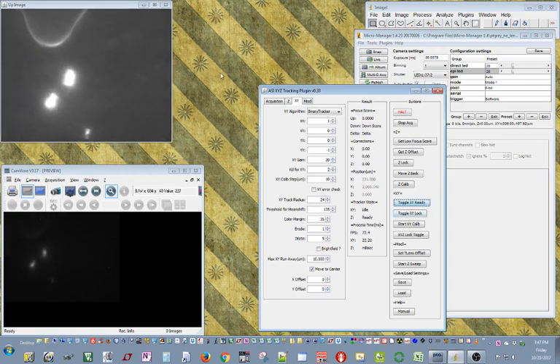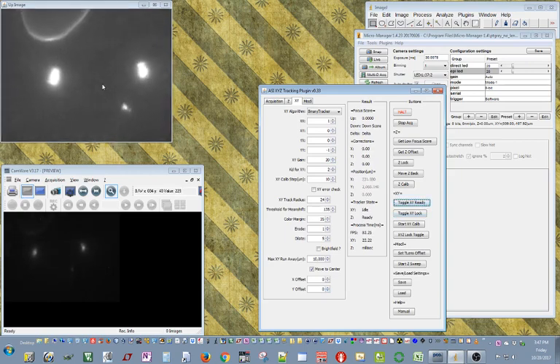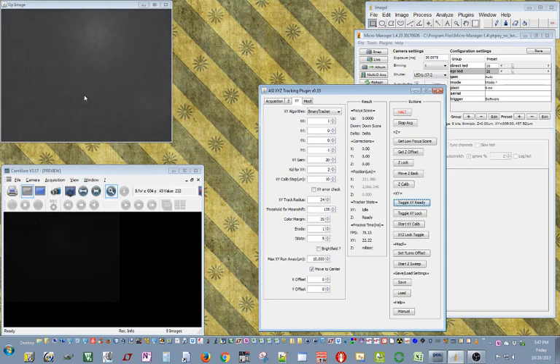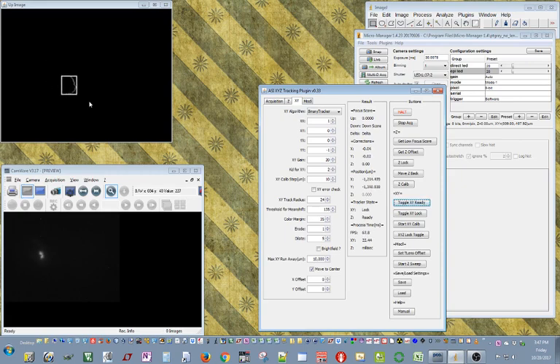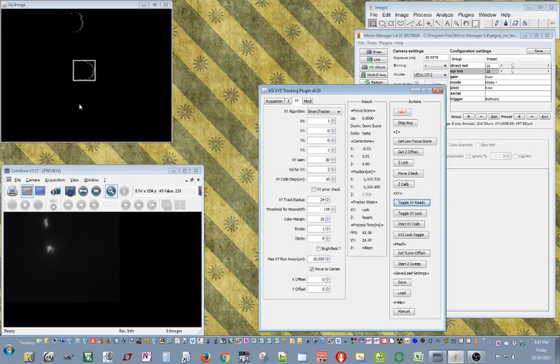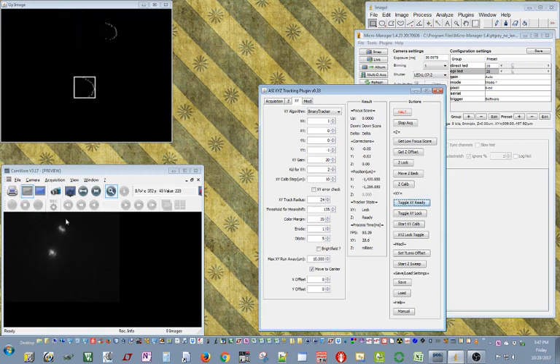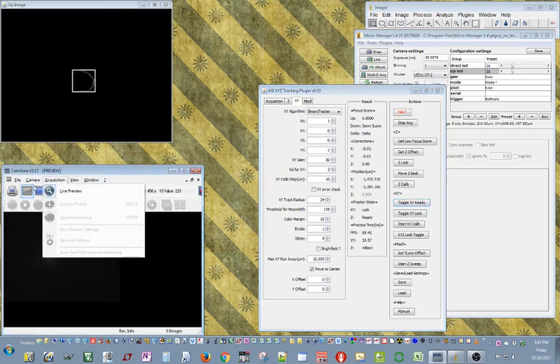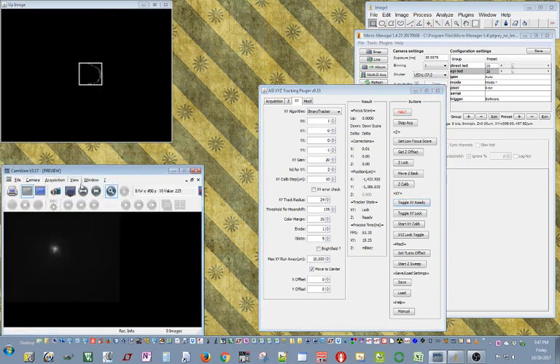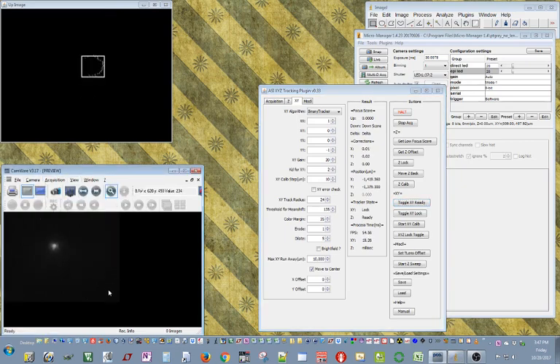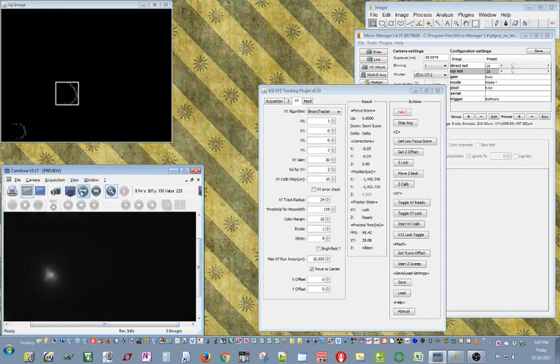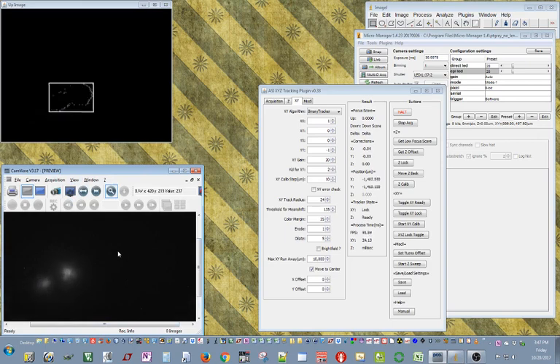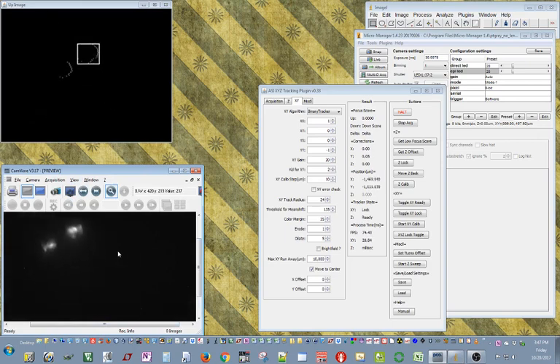Unlock here. I'm going to try and see if I can find something else, something far away. So I'm going to be as crazy. Oh, there's something here, but it's on a different Z plane. Okay. See, that was, that's guys fast. I'm going to click on it. So it starts. And I'm going to right click on it. There you go. See, it almost left the frame, but I was able to lock onto it. Yeah. And now it'll jump into some other guy. Okay. And that's the one there in a view. I'm going to increase the size. That one. Yeah.